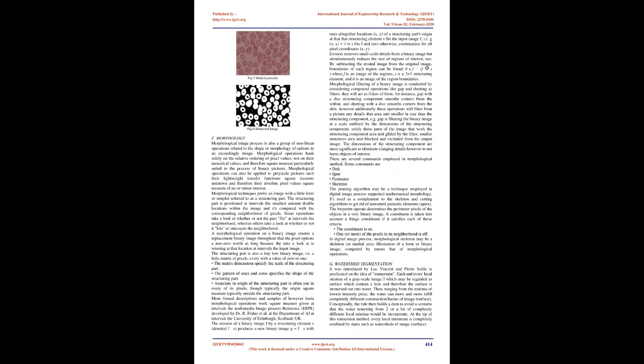It is a form of segmentation, whereby an image is split into constituent objects. This is a task commonly performed when attempting to extract an object from an image. However, like many image processing operations, it is not trivial, and is entirely dependent on the content within the image.